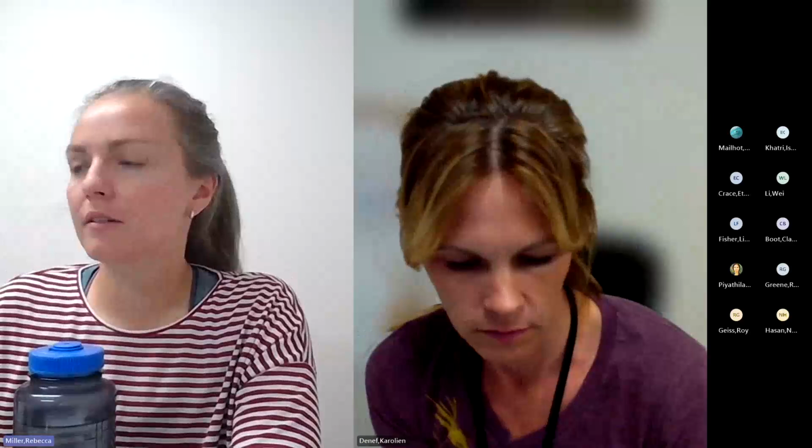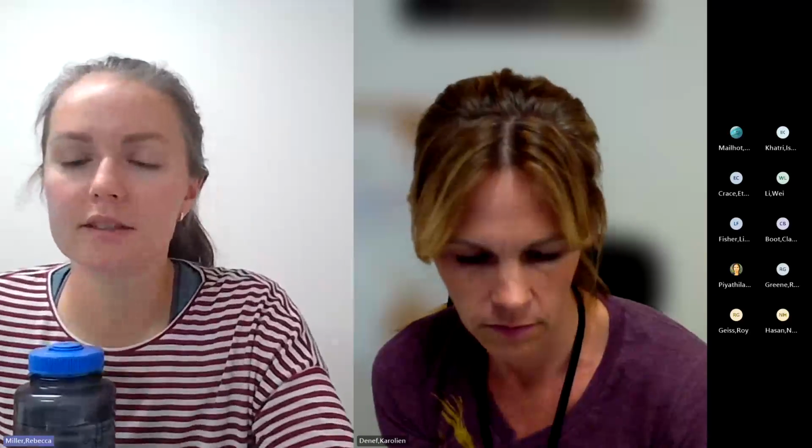Other questions? Rebecca, you mentioned AFM. Is there an AFM on campus that people can use in case they want to do better resolution profiling? Yeah, there is one. I forget the name of the contact person, but there's a website that has the name of it and the person to contact, and you can be trained to use it as far as I know. I haven't spoken with them directly, but I've directed people that way.